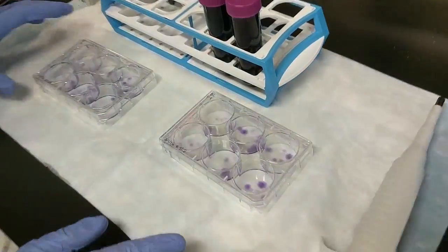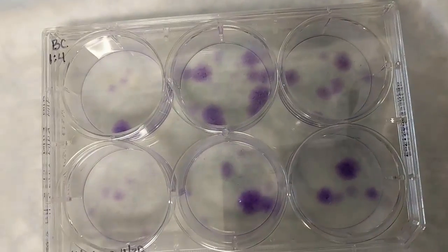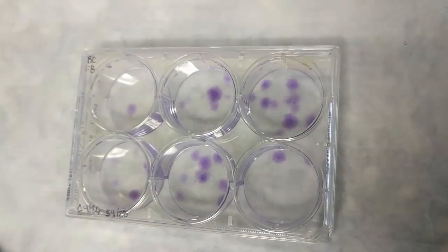Okay, that sounds great. So these little purple dots are what CFUs are all about. So when you hear the term CFU, that's what they're talking about.